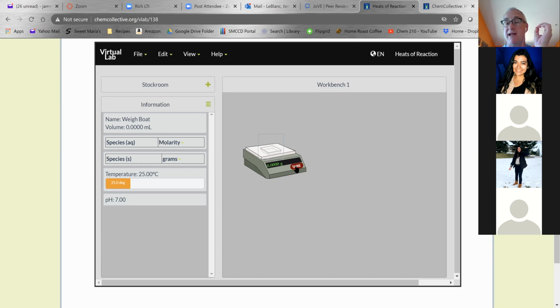Or you could use the same amount, actually. It won't matter. Just don't use less than half, because that's why 1 gram is selected: it is approximately the same number of moles that are in 50 mL of a half molar solution of HCl. So they match up.